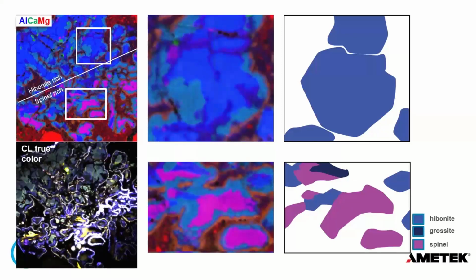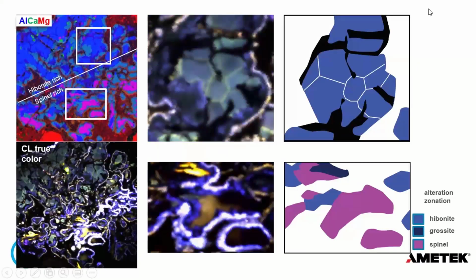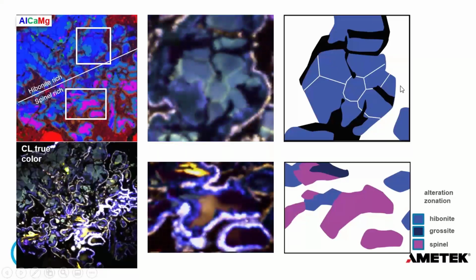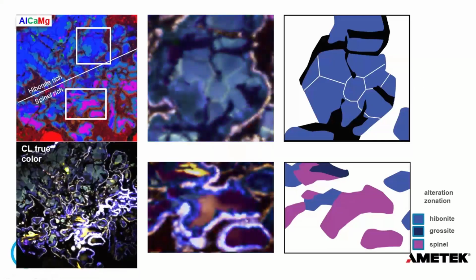The interesting thing is that there seems to be a control, based on that primary crystallization, on the microstructures that form.